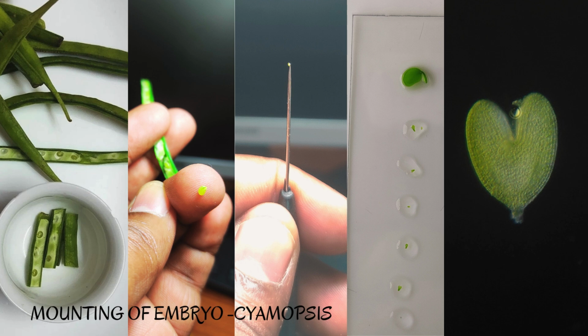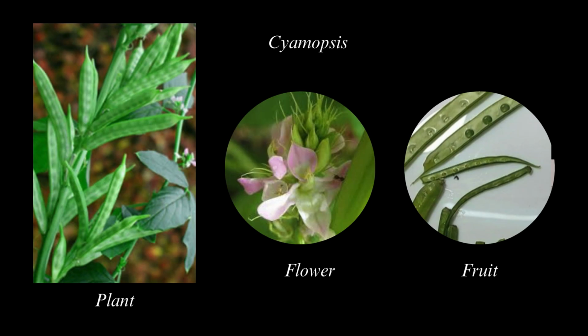Mounting of embryo, Cyamopsis. Cyamopsis tetragonoloba is a leguminous crop that belongs to the family Leguminosae. It is a pod bearing annual plant that can thrive in hot, dry climates and sandy soils.